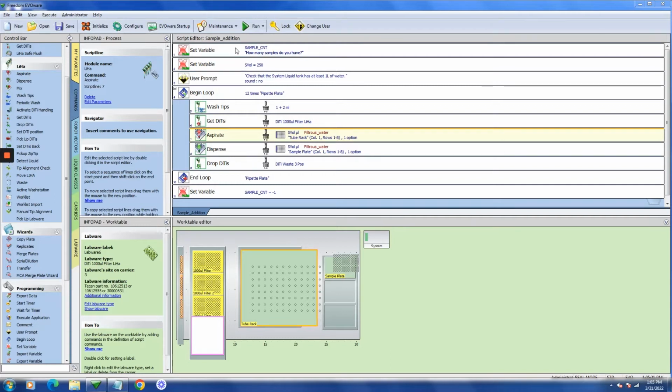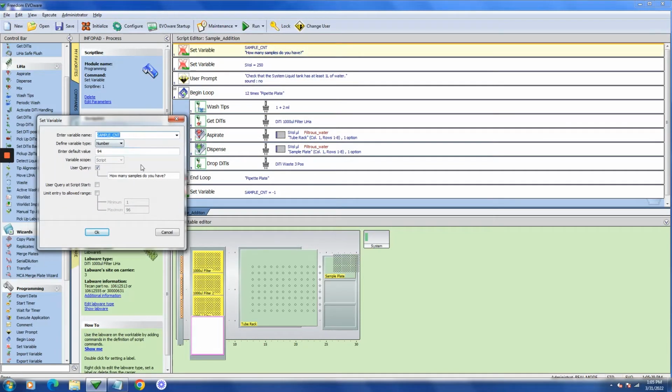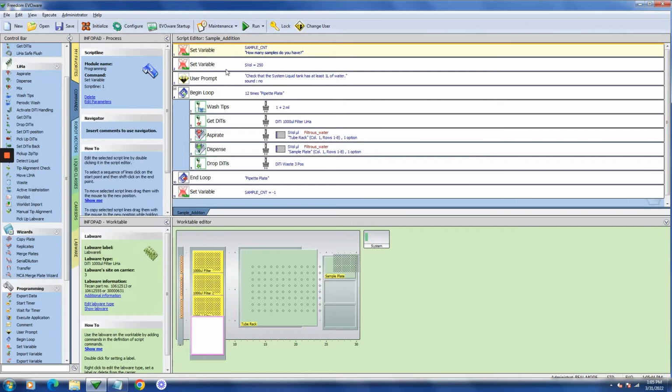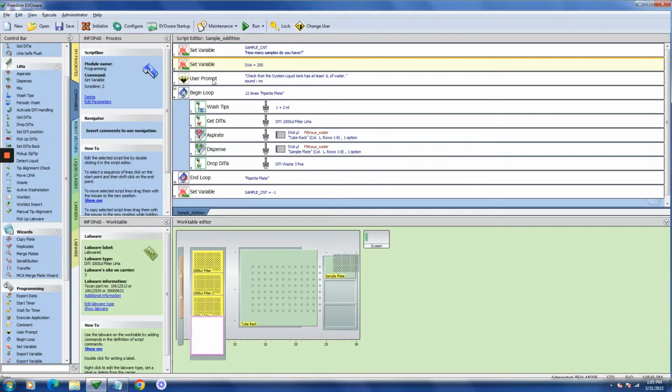The first thing we do is we wanna set the variable, and we use the function sample count. If you look here, this allows us to specify the number of samples we want from 1 to 96, and the default is 94 because we leave 2 spots for the control. But this is nice because if you don't have a full plate, you could do partial plates with this function. We set the volume here. It's nice to define a volume variable, so if you change the volume, you don't have to change all lines of code. And then you begin the loop.